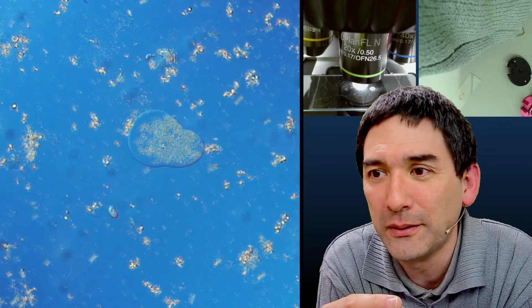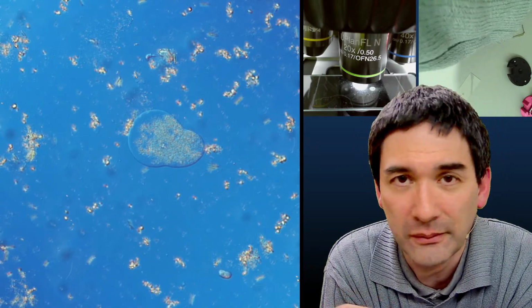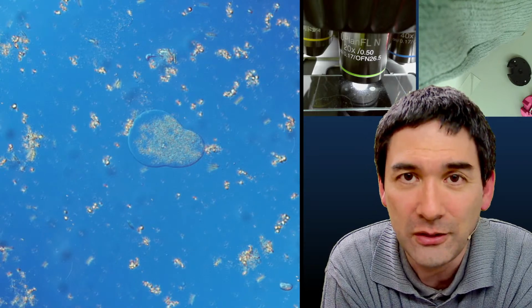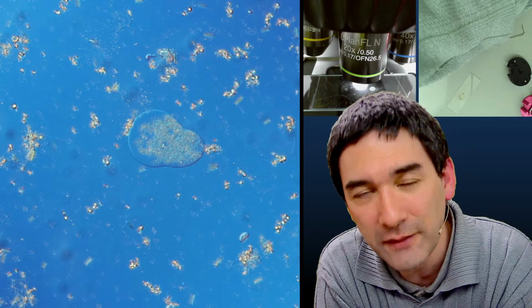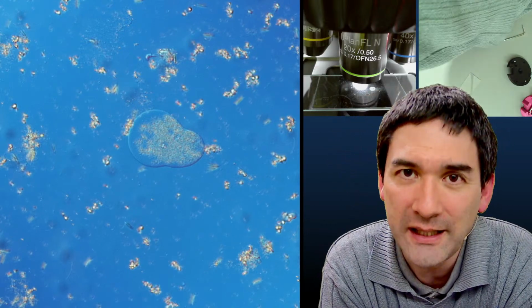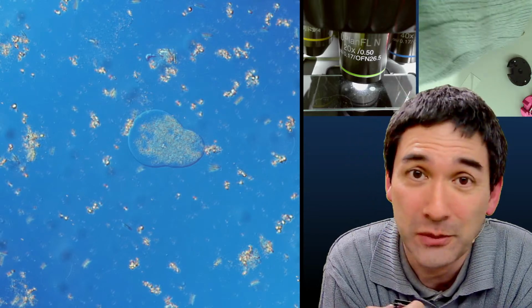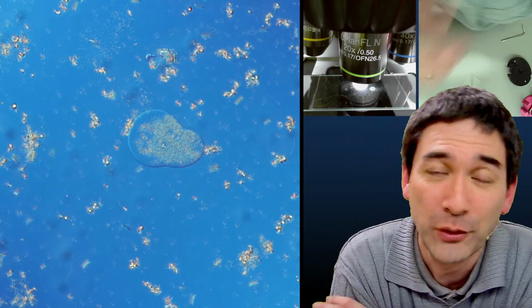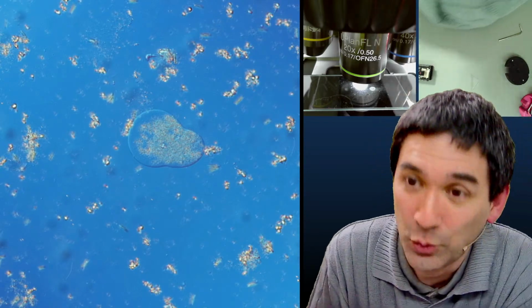They're pretty cheap. So if you need replacement microscope objectives and things like this, first always check Amazon, and then I see if I can find it also over Banggood or AliExpress, and then of course returns are not realistically possible. So if you're not satisfied, forget about sending it back. It's probably going to cost you more than getting a new one.